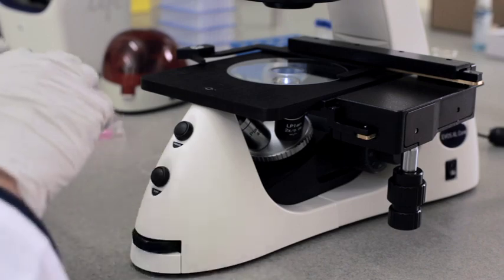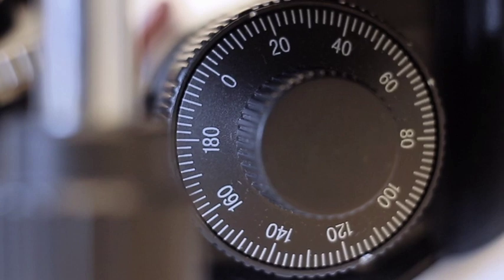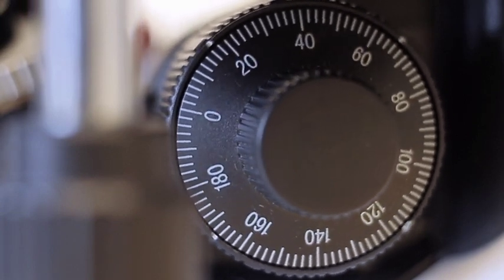To begin imaging, simply place your sample on the glass stage plate. To bring the sample into focus, use the coaxial focusing knobs on either side of the instrument.